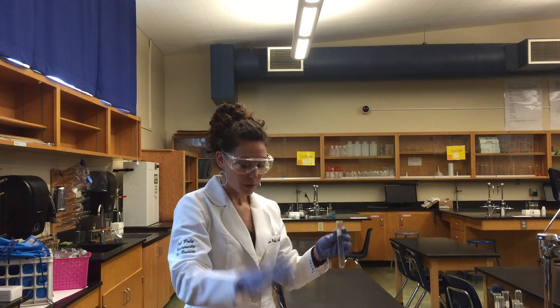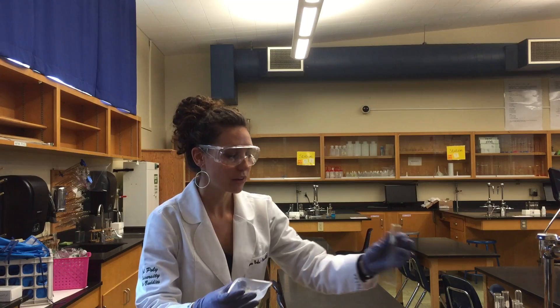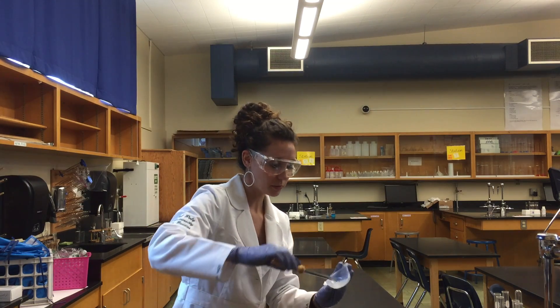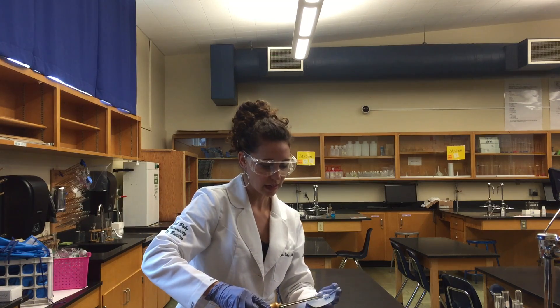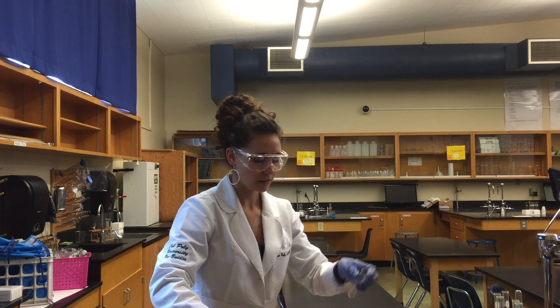At this station we will be taking calcium carbonate and hydrochloric acid to observe a chemical change. I'm going to use my spatula to get some of this calcium carbonate and we're going to add it to our clean test tube.